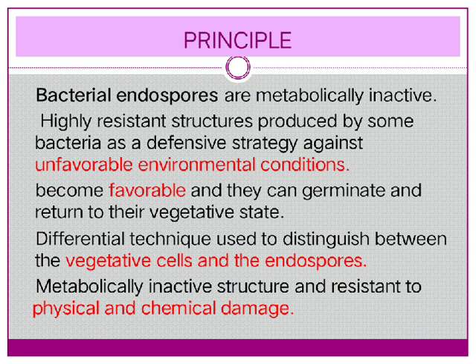Now let's see what reagents are used in this technique. This staining involves mainly four kinds of reagents: stains to give the culture color, a mordant, fixing the bacterial culture on the slide, and decolorizing. First, the primary stain, malachite green. It is forced into the spore by steaming the bacterial emulsion. Malachite green is water soluble and has a low affinity for cellular material.